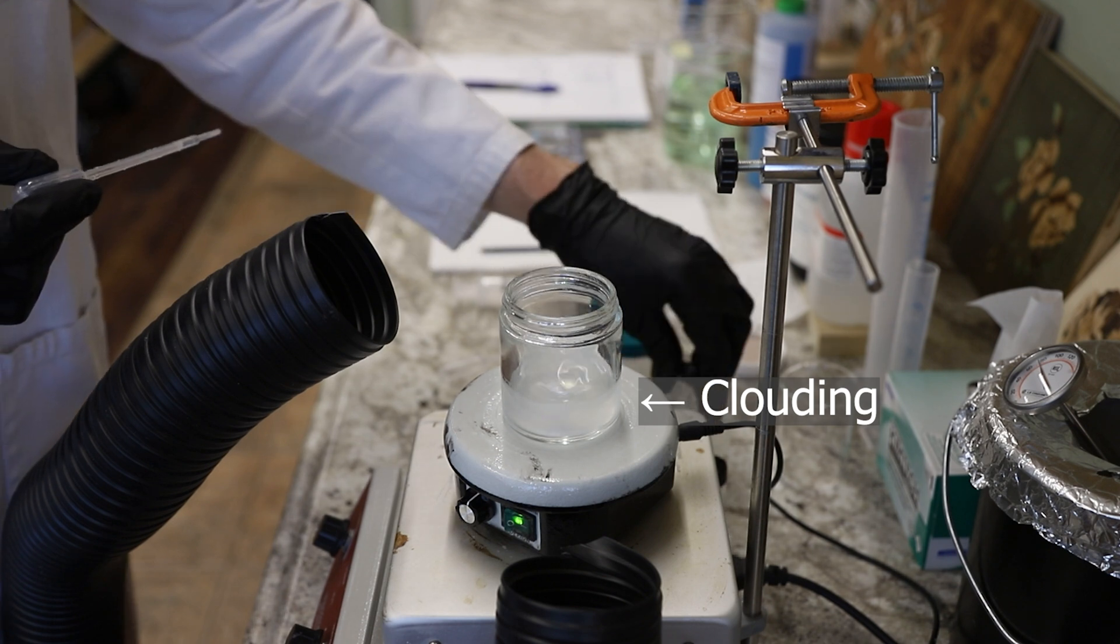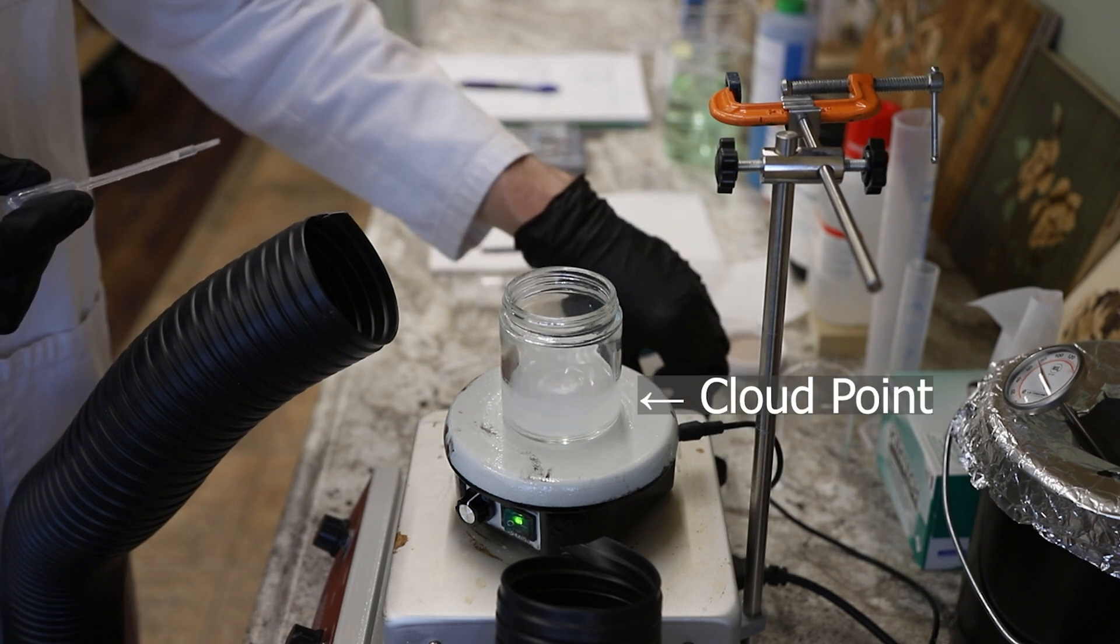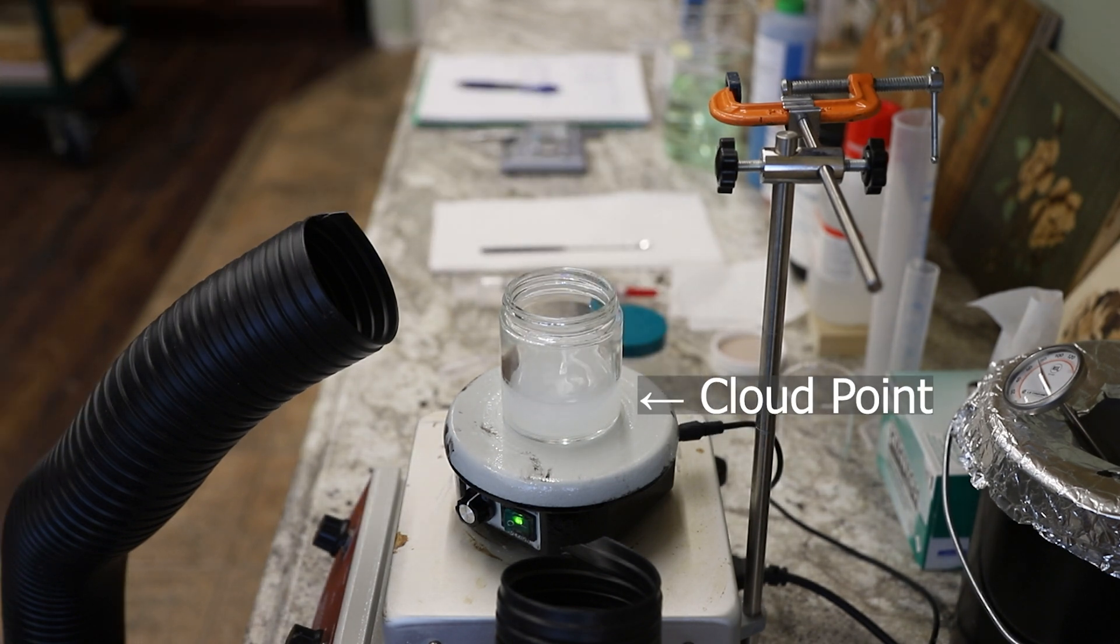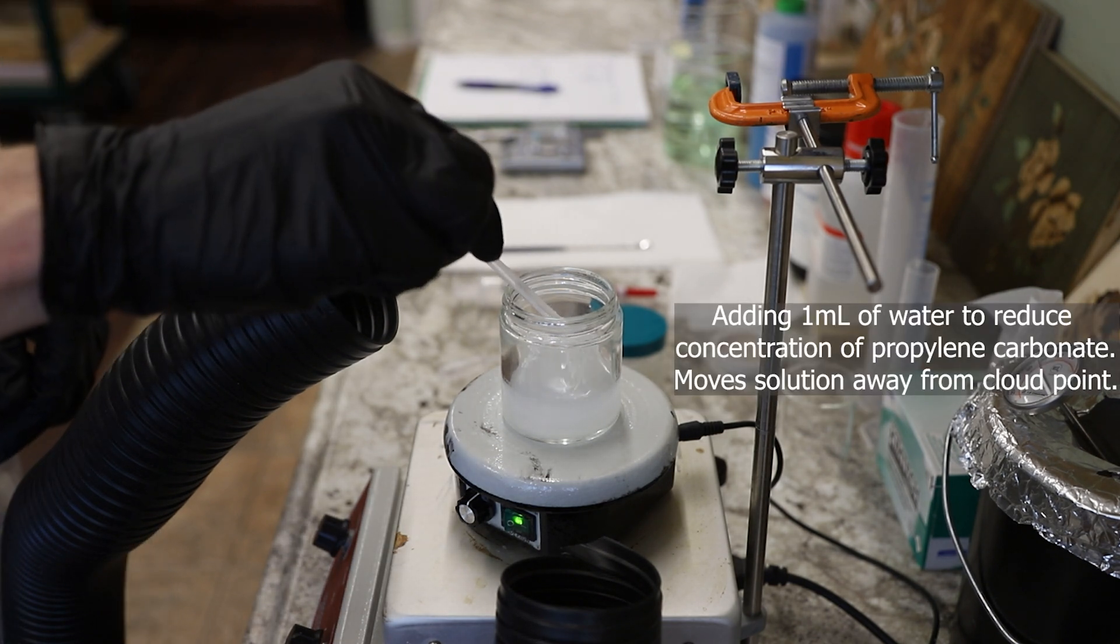And then it gets to a certain point where it is at its cloud point, and that is where the solution is totally opaque. You can no longer see the stir bar. And at this point, the solution is not usable. You actually have to bring it back a little bit.